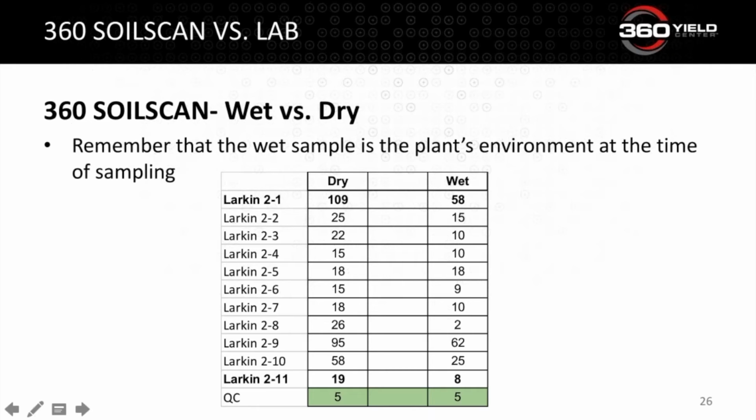The other thing I'll draw your attention to is if you look at these numbers, kind of what we were talking about, where there's more nitrogen available to convert and nitrify, those spreads are bigger. They're larger. But where there's not nearly as much nitrogen, the spreads are smaller, and you don't really see those big differences. So let's advance on.